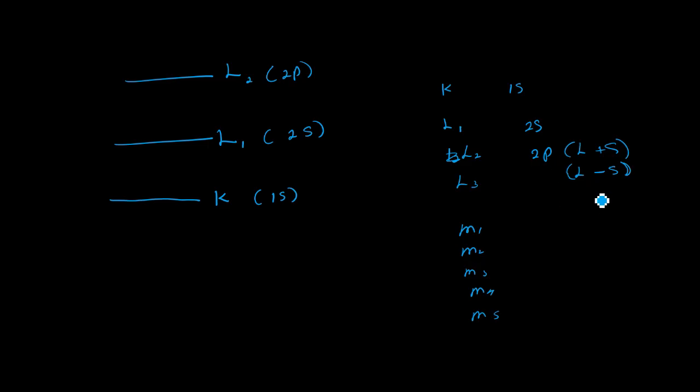These are basic quantum representations of electrons, but these surface analytical techniques are a little advanced for your degree programs, and in your first years you may have to cover these things. L3 also refers to 2p. M1 means 3s, and M2, M3 mean 3p levels, likewise. So there are these nominations.